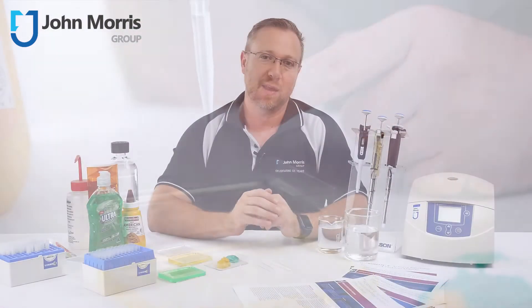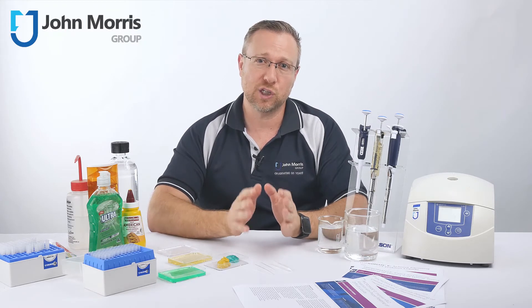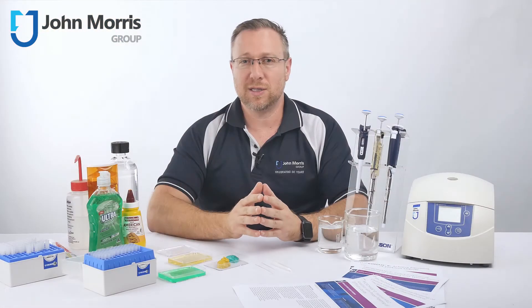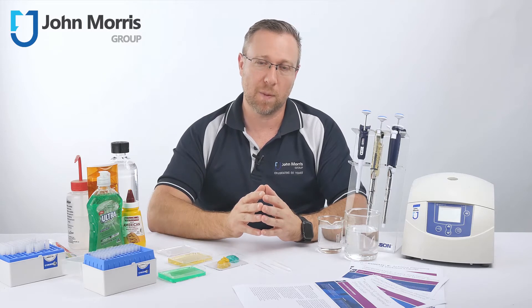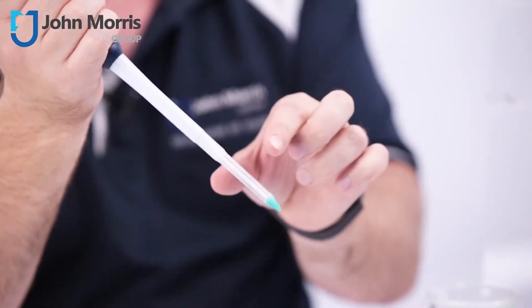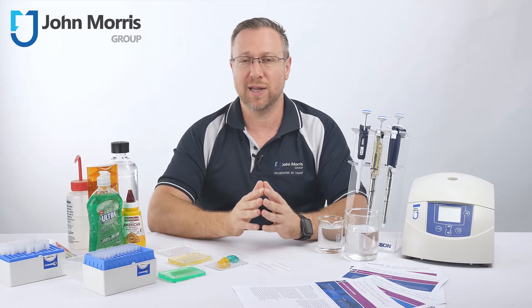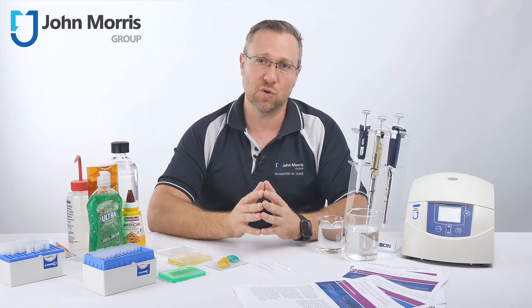This differs entirely from the way a positive displacement pipette works. With a positive displacement pipette, the piston is part of the specialized disposable tip called a capillary piston, or CP for short, and it is in direct contact with the liquid you're pipetting. This eliminates the air cushion so volume accuracy is not affected by the fluid's properties or how it interacts with the surrounding environment. As an added benefit, the disposable capillary pistons also prevent contamination, ensuring the user and the pipette are protected — no aerosols can enter the pipette, potentially cross-contaminating samples or damaging internal components.